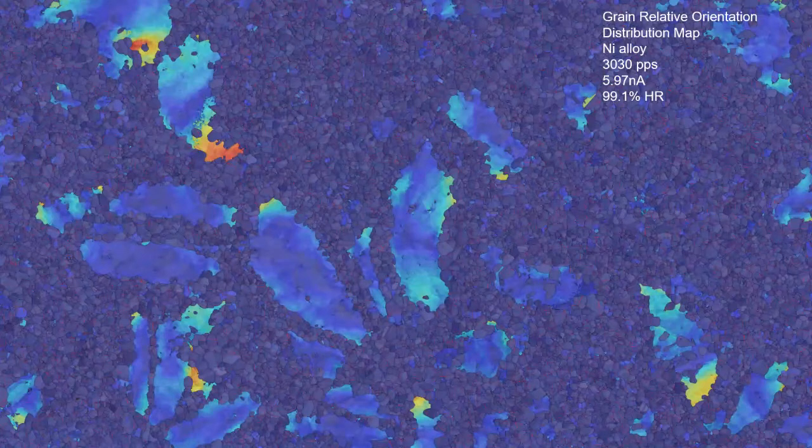This is a nickel superalloy. This is 3,000 measurements a second, about 6 nanoamps, 99% indexing rate. And here you can see that most of the grains are recrystallized, but there are a few large grains here which haven't recrystallized. It's a partially recrystallized structure.